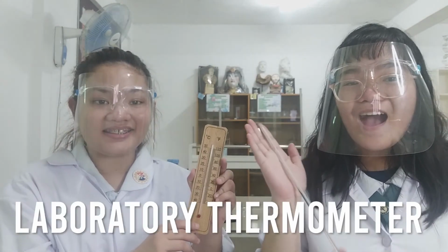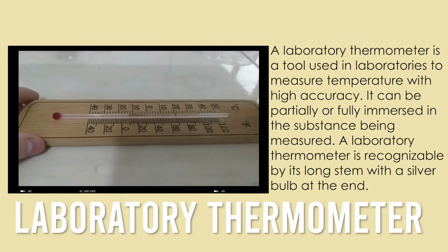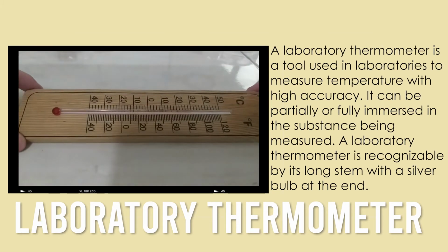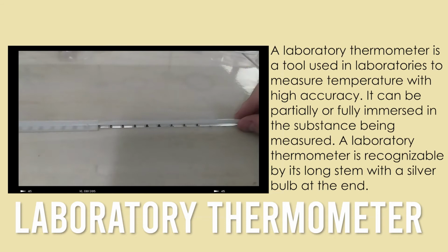A thermometer? Are you sure? Yes. Yes, a thermometer. It is also called a lab thermometer because it is not intended for measuring body temperatures, but for checking the temperatures of chemicals and other substances.